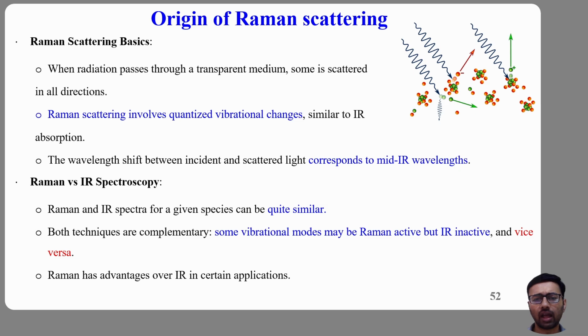At first glance, Raman spectroscopy may seem similar to IR spectroscopy. Both techniques provide information about molecular vibrations, bond strengths, and molecular structure, but the physical mechanism is entirely different. IR spectroscopy measures the absorption of light, Raman spectroscopy measures the scattering of light, and that distinction changes everything.